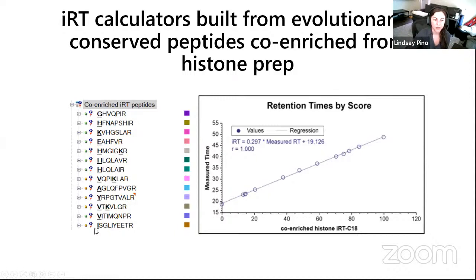All of the N-terminal amino acids are modified here because we perform 2 rounds of chemical derivatization on our histones. So we perform propionylation at the protein level so that all of the N-terminal protein is labeled and all the lysines that are unmodified get modified.